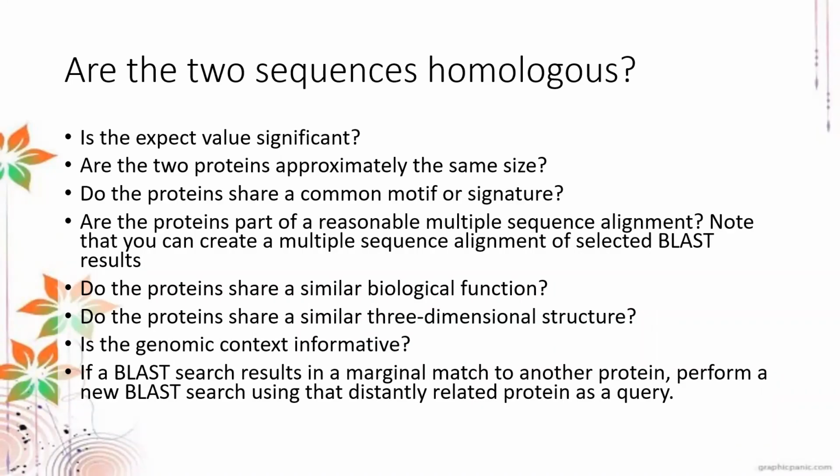So that's it for the BLAST search. All in all, it depends on what you really want to know from the BLAST search. Okay, so that's it for the BLAST algorithm search. And so this ends the BLAST lecture.